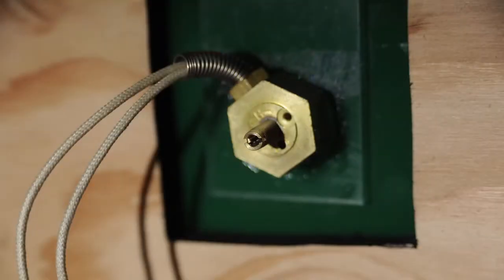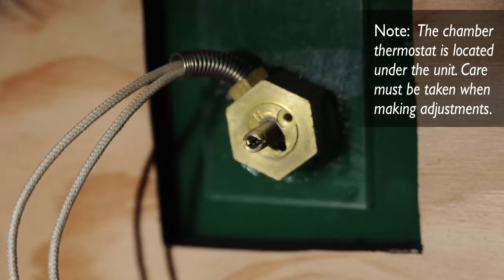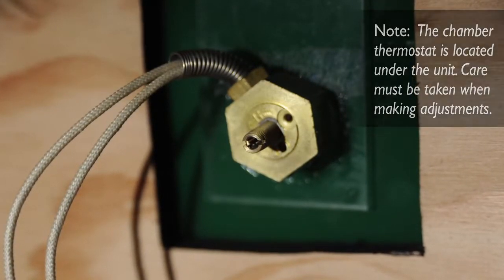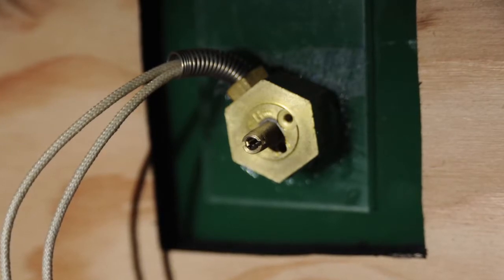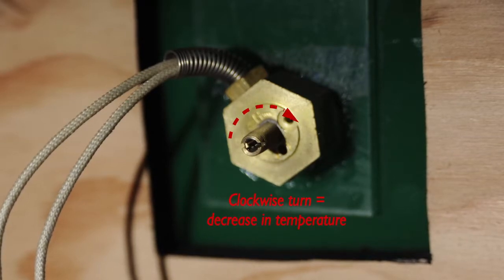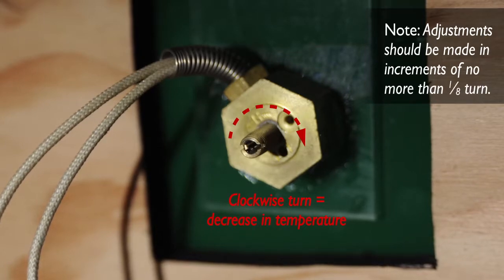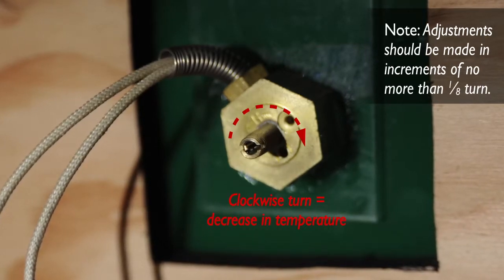The thermostat, located in the testing area of the chamber, controls the temperature inside the chamber at 95 degrees Fahrenheit, plus or minus 2 degrees, or 35 degrees Celsius. The thermostat controls an air heater mounted to the blower. This thermostat has been factory set and should not require adjustment. If it is necessary to change the temperature, the thermostat can be adjusted — turning the adjustment screw clockwise decreases the temperature. Adjustments should be made in increments of no more than one-eighth turn.